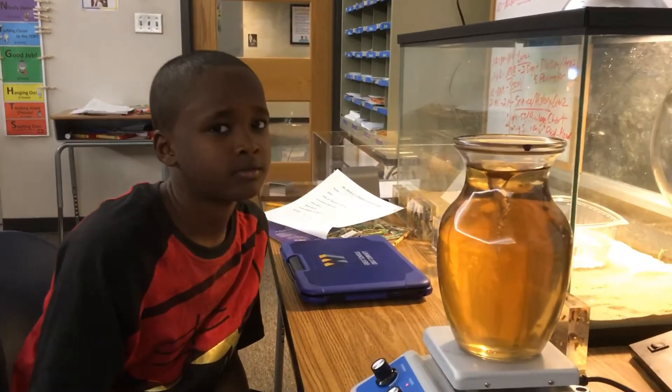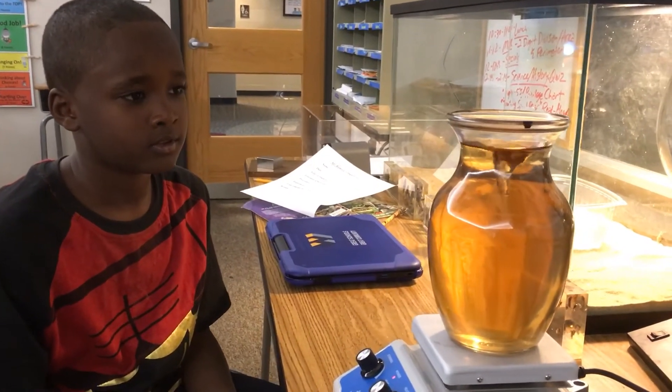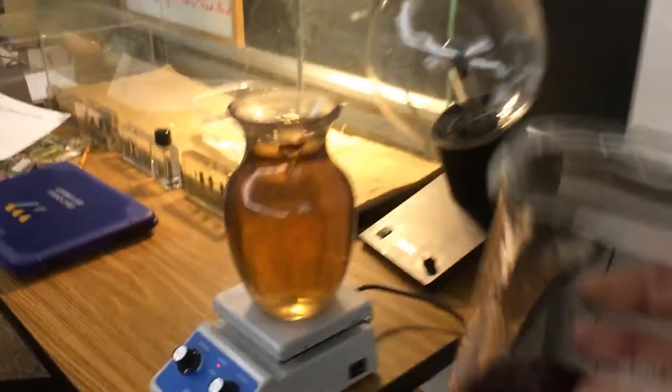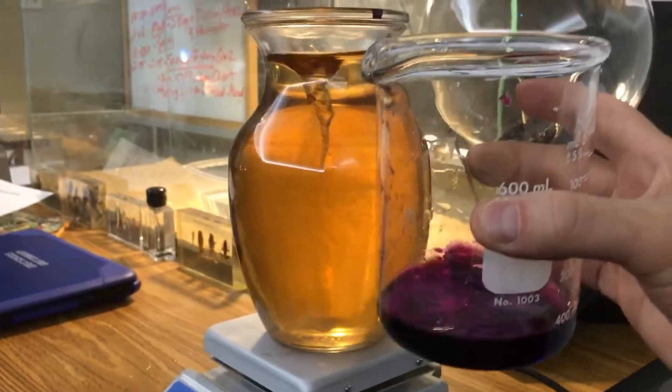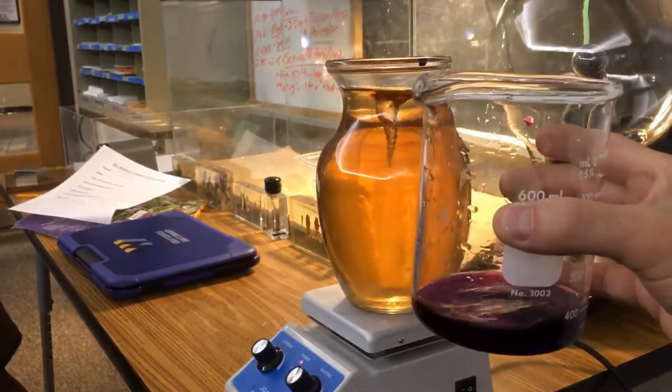It looks like it went from purple and now to green, and now it looks pretty yellow. Let's go back to the original — it originally looked like this. So a big color change there. Nice job, Darren!